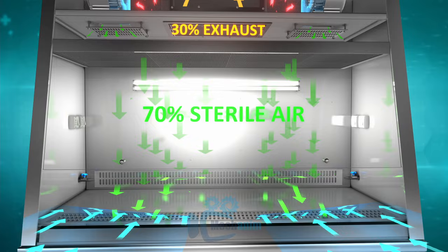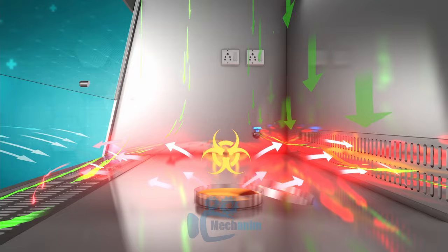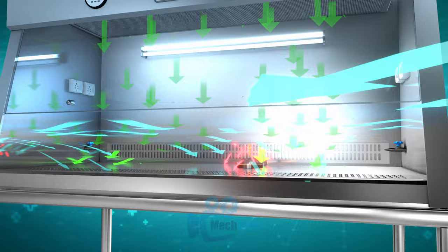Seventy percent of HEPA filtered air enters the cabinet from above and flows down on work surfaces under unidirectional flow. The air supply to the inside chamber is evenly distributed around the work surface with laminar flow, which prevents cross-contamination between samples.